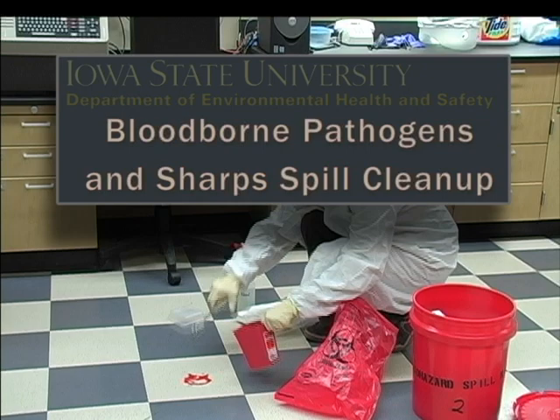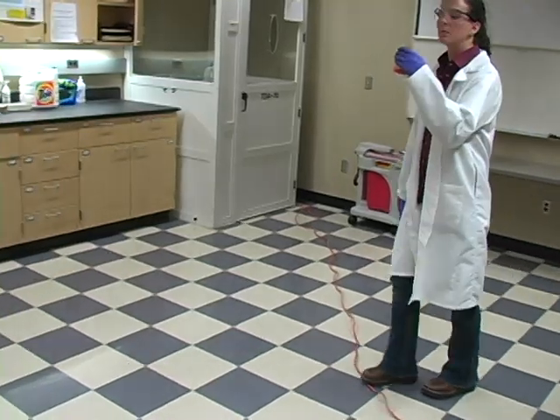Cleaning up a spill involving blood-borne pathogens or sharps is a dangerous task. Follow these steps to ensure a safe cleanup.